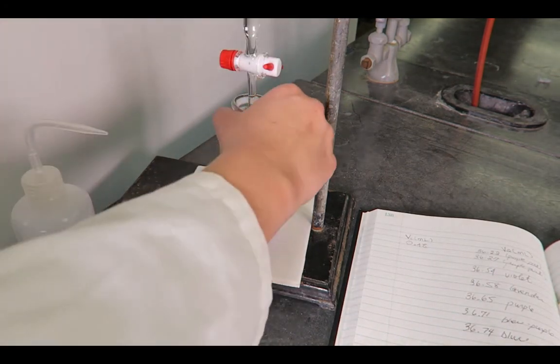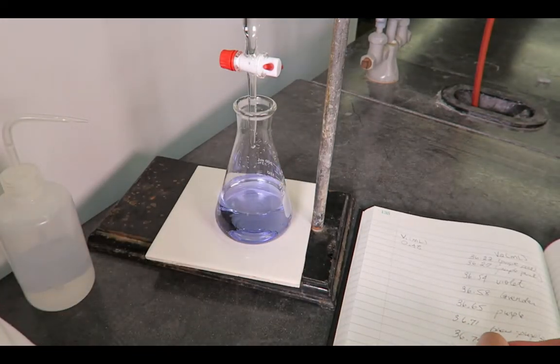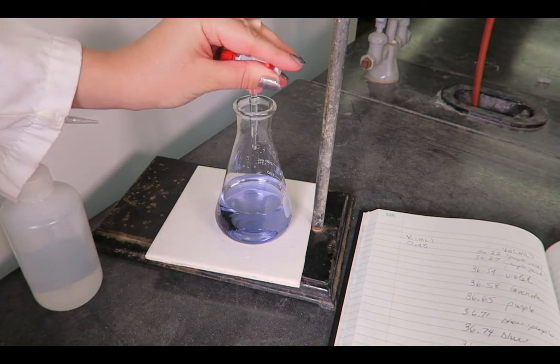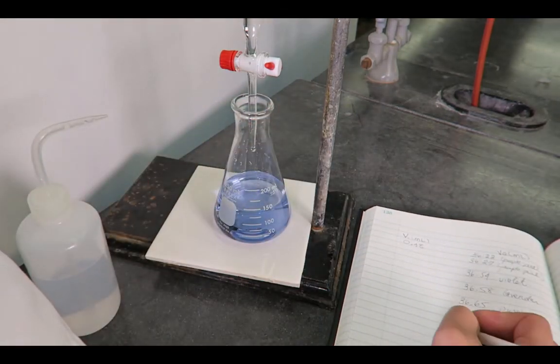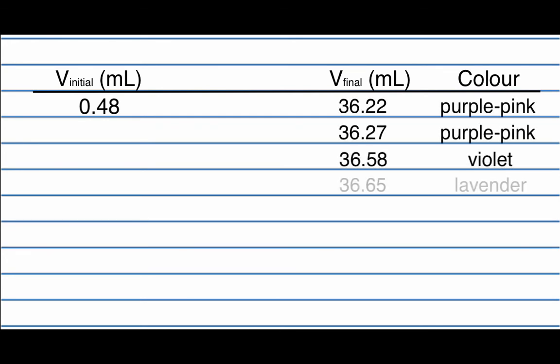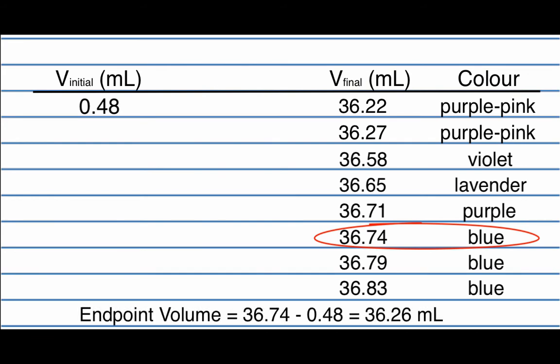Continue adding drops and record the burette volume and indicator color until the indicator color remains constant. The endpoint is then identified as the burette reading in your laboratory notebook that corresponds to the greatest indicator color change. The volume of titrant delivered is the difference between the final and initial readings.